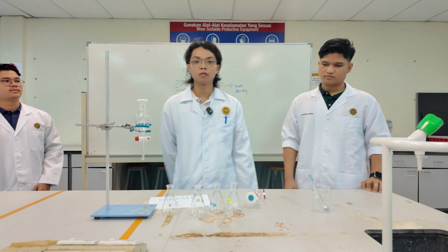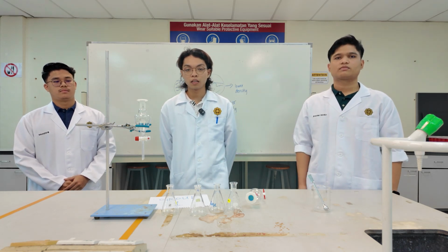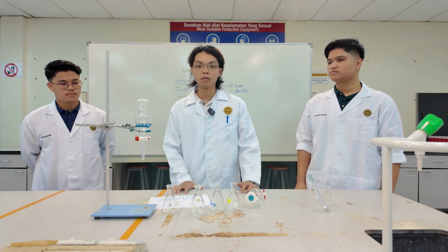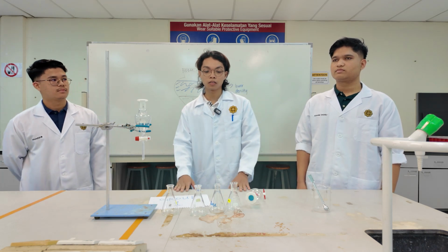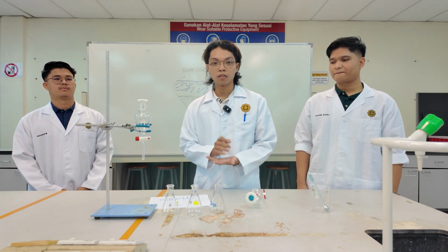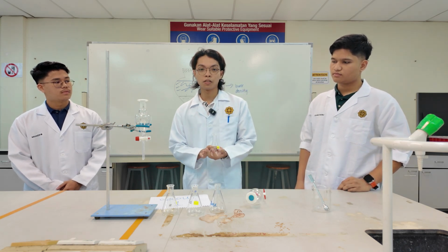Okay, Assalamualaikum warahmatullahi wabarakatuh. My name is Amirrul Aziz. My matric number is 2312179. And I'm going to present the second part, which is how to separate the base and the neutral. As you know, after the first part, we separated the acid, and then we still have the mixture. In this flask, they still have the base part and also the neutral one. So how do we separate these?